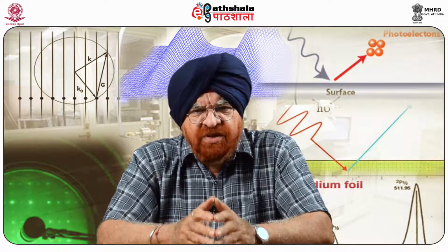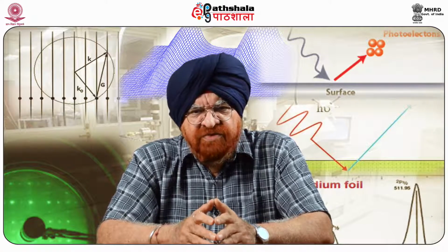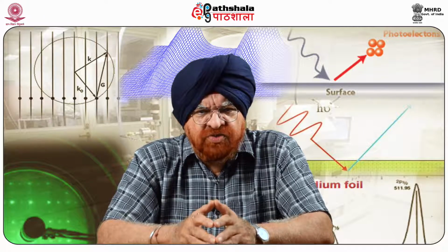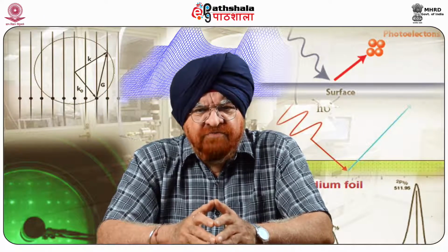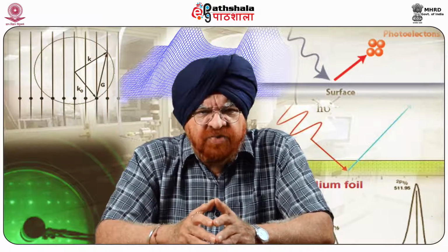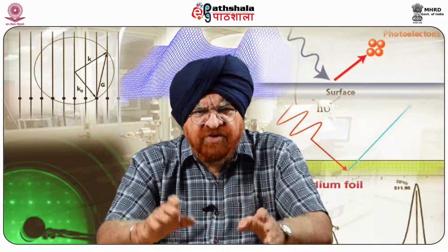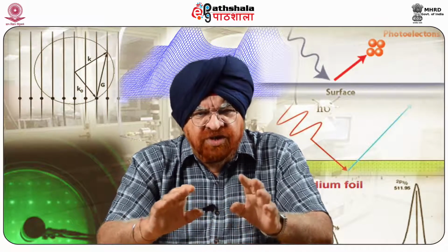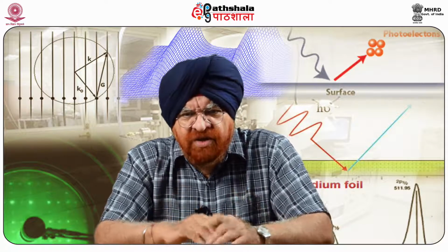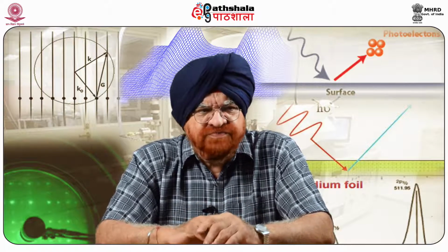The scanning tunneling microscope, STM, as I said, is abbreviated, and the atomic force microscope, AFM, both at times used in unison, are scanning probe microscopes capable of resolving the details of a surface down to the atomic level, which is an extremely low level to understand.